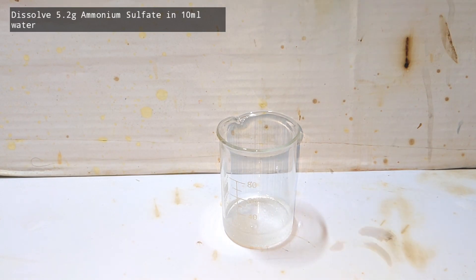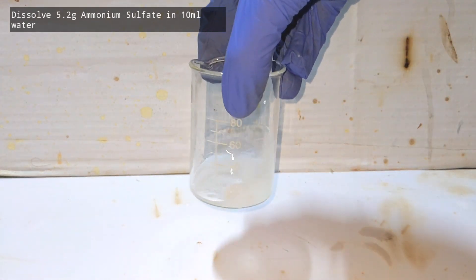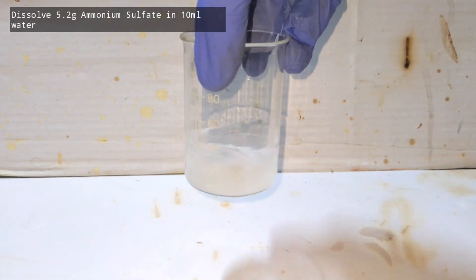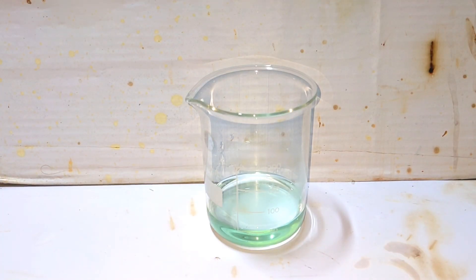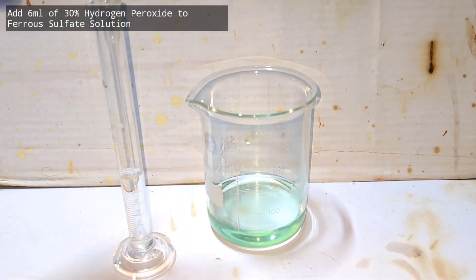Now let us make the ammonium sulfate solution by dissolving the ammonium sulfate in 10 milliliters of distilled water. Here we have the iron(II) sulfate solution — it has a nice green color to it.